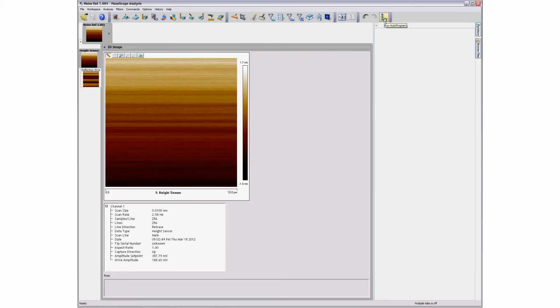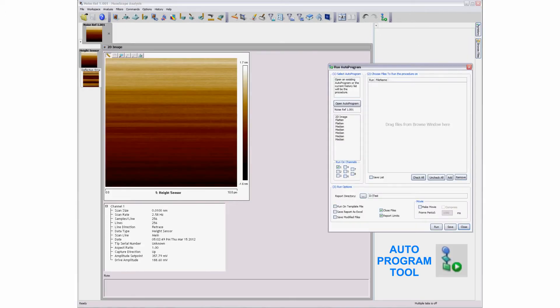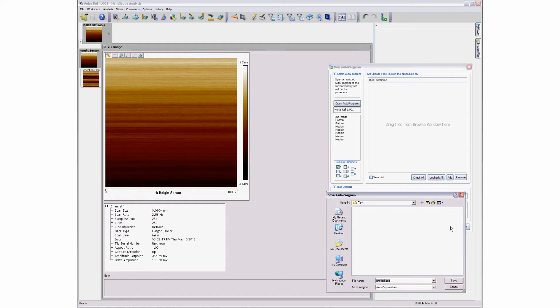Opening the Autoprogram dialog window reveals the recorded commands from the history cache. The sequence can be saved to a file name and then opened again, restoring the command steps into the Autoprogram window.